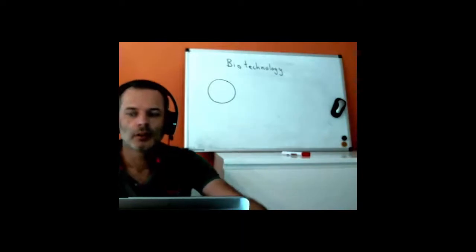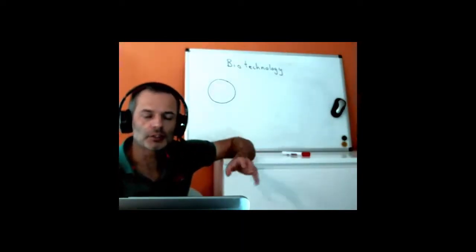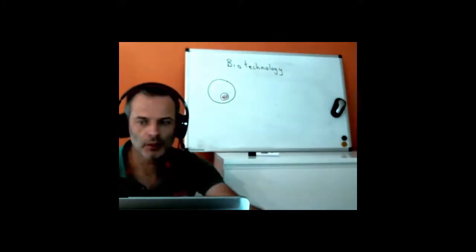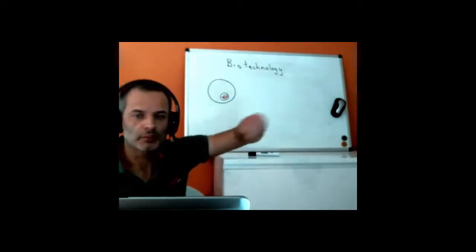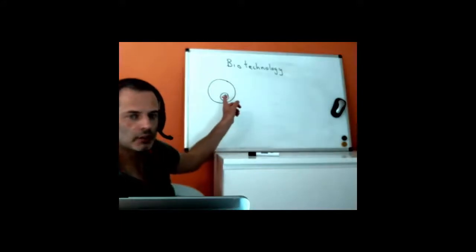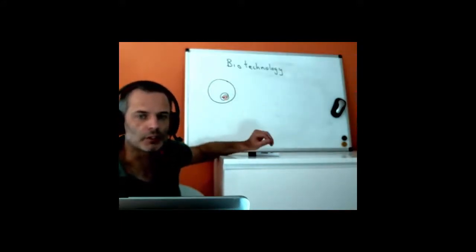we want. So taking a simple example of extracting DNA from a cell, we're only interested in getting the DNA out of the cell and keeping it for some other use. We will do this in the lab later, but today we'll look at it theoretically. So we want to take this DNA here out of the nucleus of a cell. Let's imagine it's one of my cells.